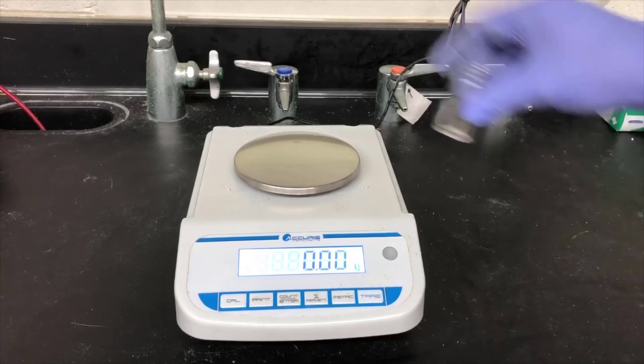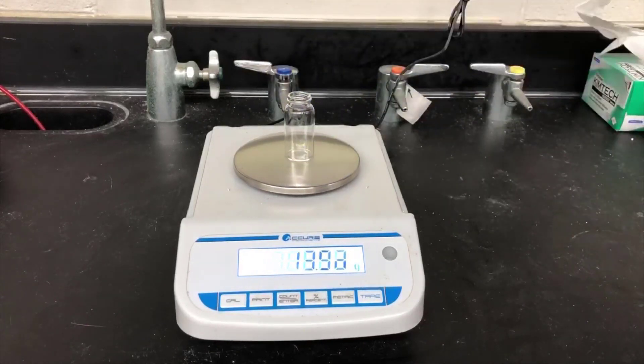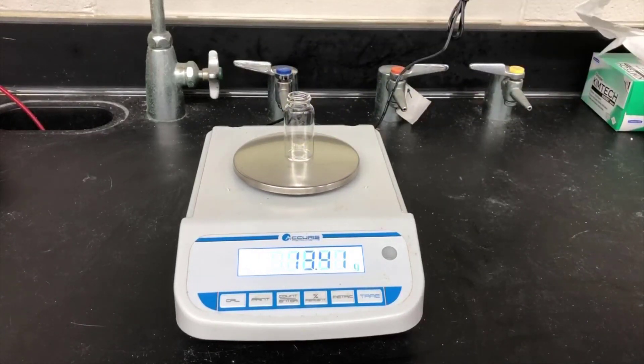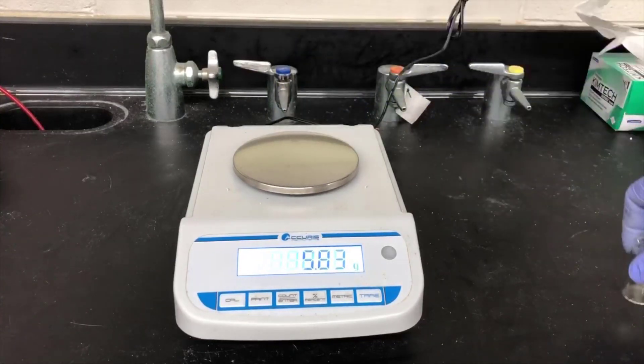Get a clean dry vial, determine its mass, and write this value down in your notebook. We'll use this value to determine the mass of our product by difference once we've evaporated the ether.